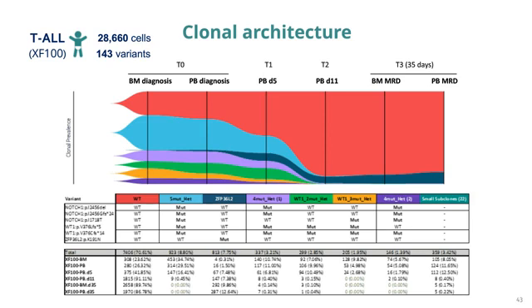If you look at the mutations of this clone, it seems that it's a very different clone compared to the rest. So it's the only one that has a mutation in the zinc finger protein gene. This mutation only appears in this clone and it doesn't have a mutation in Notch1 or WT1.